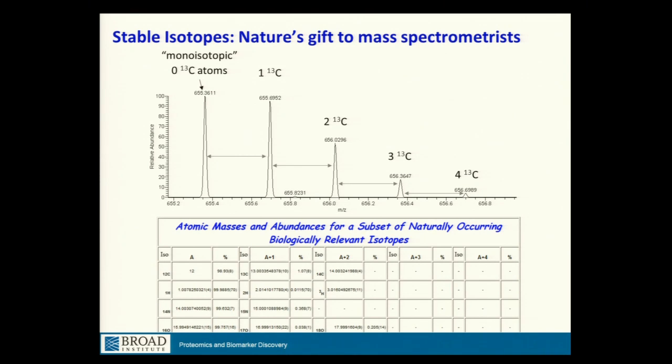And we kind of know that it has a whole bunch of carbon atoms, and just given the natural abundance of C13 in nature, we can know a priori that some of those molecules in our ensemble of 1,000 are going to pick up at least one carbon-13 just by its natural abundance, or 2 or 3 or 4, and we can use that to determine the charge on this molecule. But then we can also use these stable isotopes in more clever ways to affect quantification.